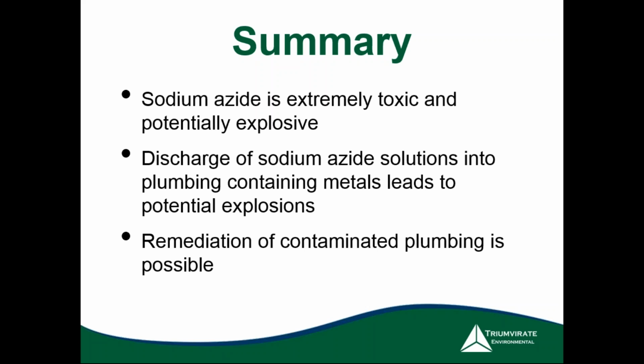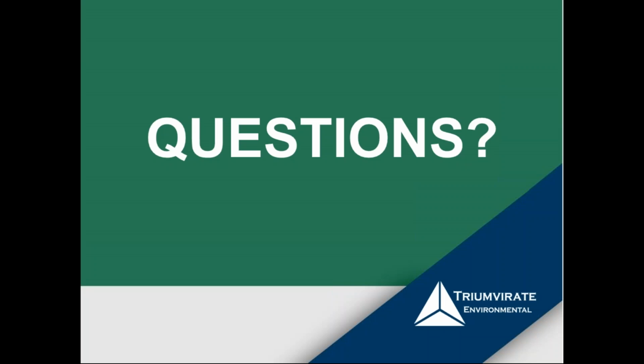So remediation of contaminated plumbing is possible. We utilize the procedure that was prescribed by the CDC and NIOSH, and we've been successful with it, and it works. So with that, I'll turn it over to James.